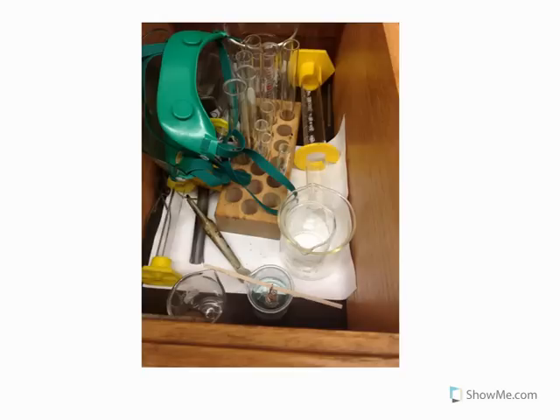Record any observations that you may be able to make to see what types of things are happening in the reaction at this point, and then carefully transfer your beaker with the silver nitrate and copper to your drawer. It's going to sit there overnight and continue to react.